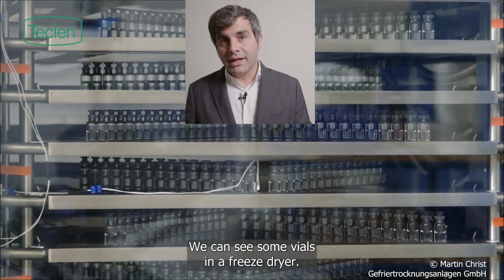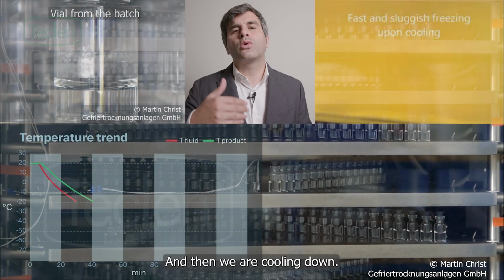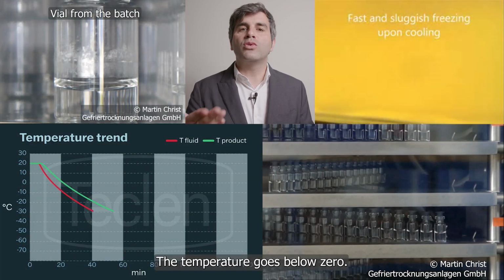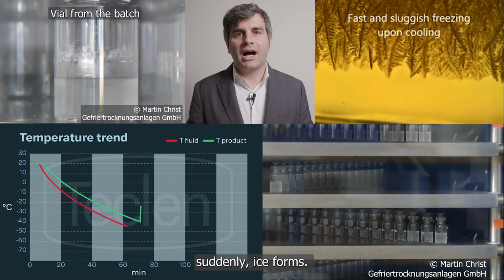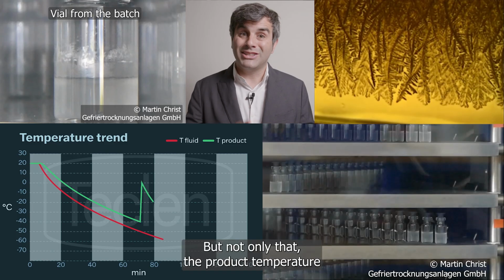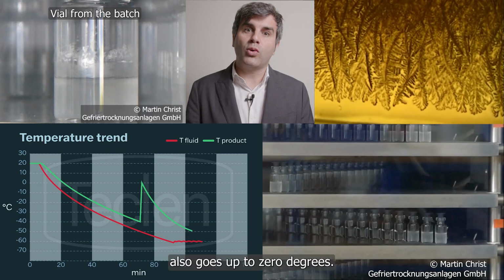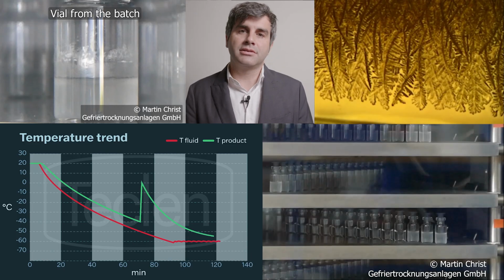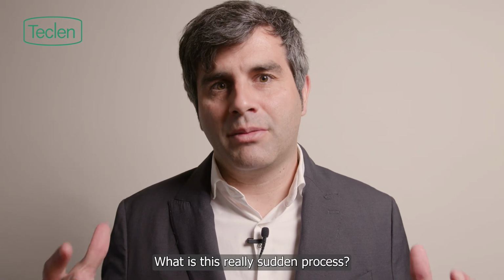We can see some vials in a freeze dryer with a sucrose dissolution in them, and then we are cooling down. The temperature goes below 0, and after some time, suddenly ice forms, occupying the whole vial volume. But not only that, the product temperature also goes up to 0 degrees. What just has happened? What is this really sudden process?